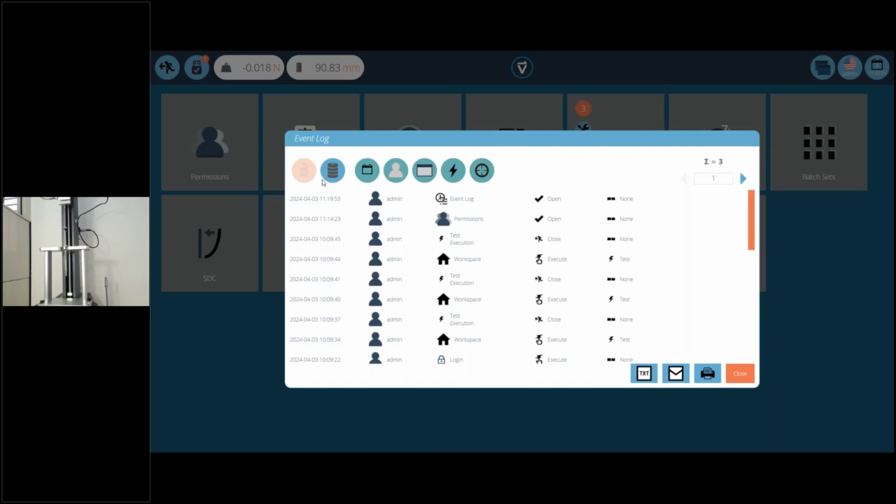And you can actually filter through these records by querying the database: querying the actions on a particular date, the actions for a particular user, the actions for a particular test, and even the actions for a particular command. For instance, if we wanted to find out any user that clicked on the delete function, we can narrow it down to that, or to a targeted command in the test. How many users clicked the run command to run a test? So all these different facilities are available to an administrator. Now, by default, the audit trail is only accessible to the administrator.